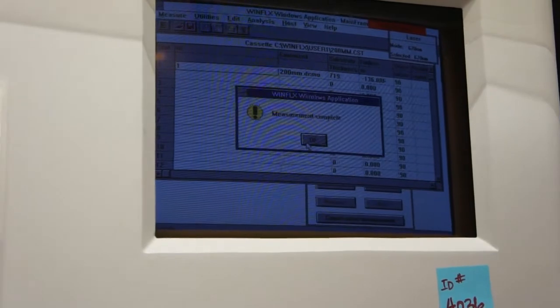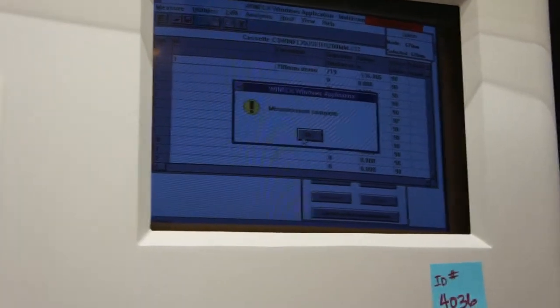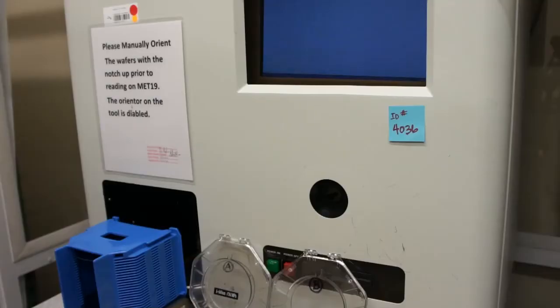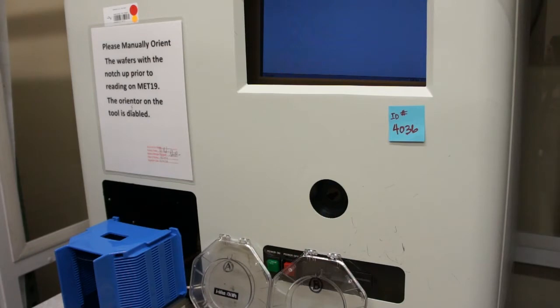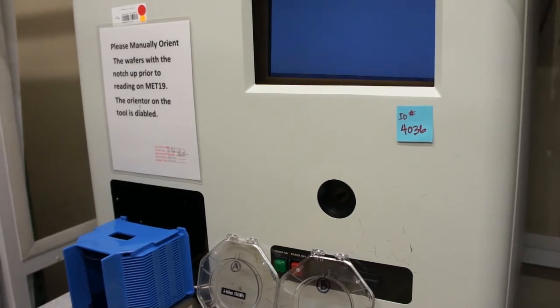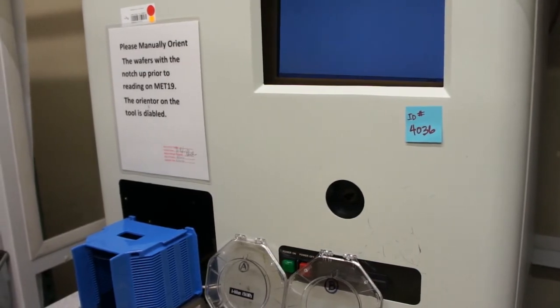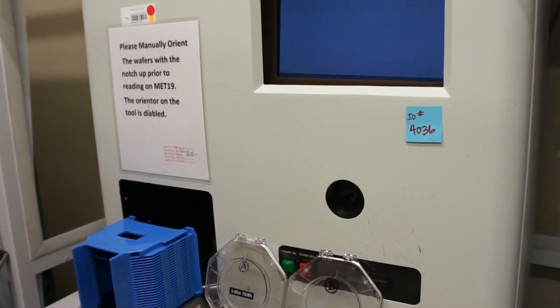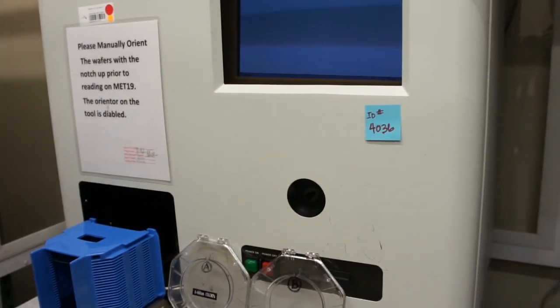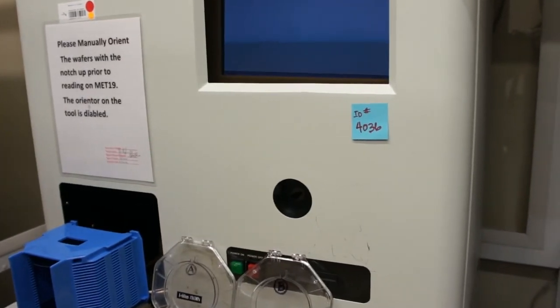Okay, let's go with part 2 next. This is part 2 of the proof of life video for class 1's Flexus 5400 ID 4036.